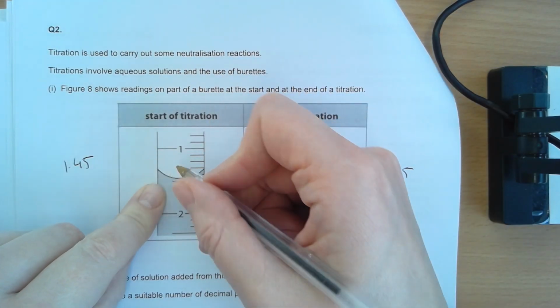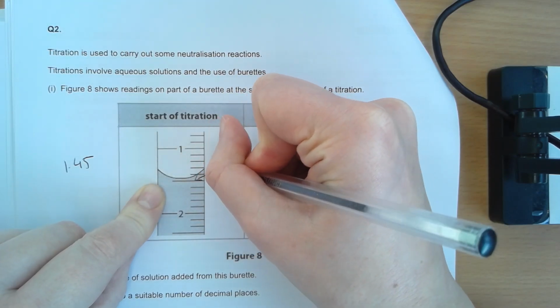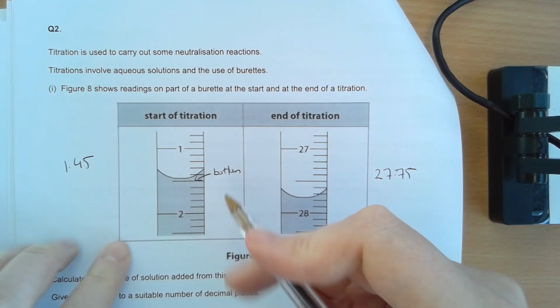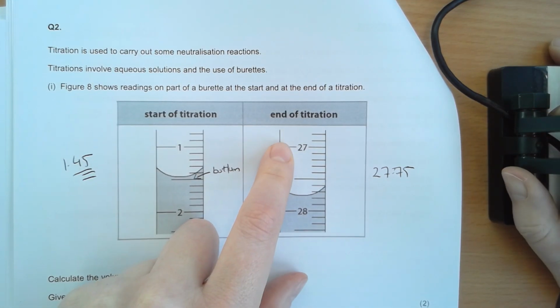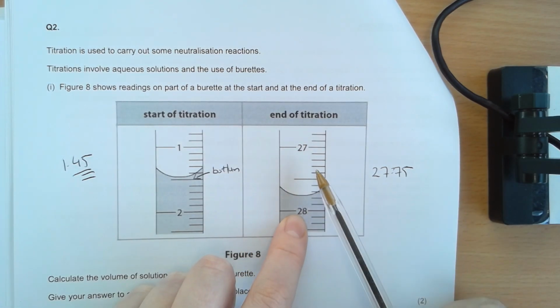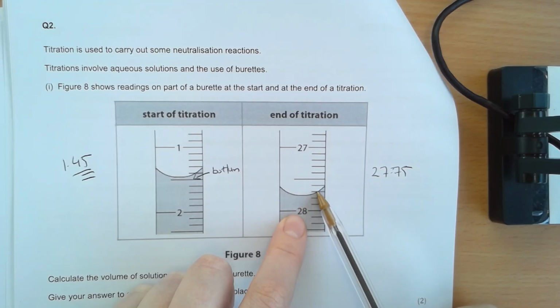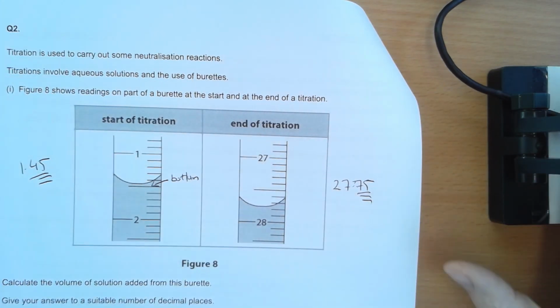So this is called the meniscus, this curve, and we say that we read from the bottom of the meniscus, so you're reading from that point right there and it's 1.45, and you have got to record to 2 decimal places. Similarly here, you're reading down, so it's going to be 27 point something, and again the bottom of the meniscus is between 7 and 8, which makes it 27.75, always recording to 2 decimal places.